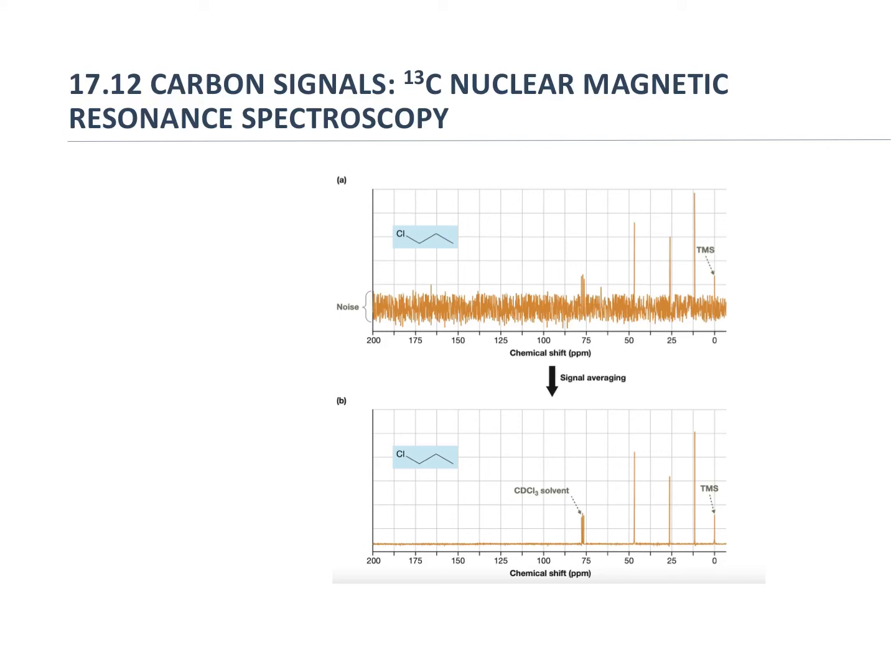So this is the last type of spectroscopy that we're going to talk about in lab. This is also the last type of spectroscopy that's in your packet. When you look in your packet, you're going to see, of course, IR, mass spectrometry, and then proton NMR, but you're also going to see carbon NMR. We're going to talk a little bit here in these last remaining screencasts about carbon NMR, and then some other interesting NMRs that you can see, because remember, we're just scratching the surface. There are whole classes that are dedicated to this.